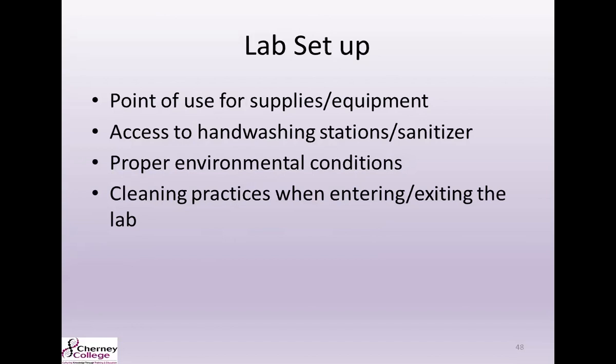You want to have your supplies and equipment at point of use. Like I said, you don't want to be running all over the lab. Make sure you have those supplies ready and in the best spot to be able to use them when you need them. Make sure that you have access to hand washing stations, lots of sanitizer. Make sure you have the proper environmental conditions, and make sure that you have accurate cleaning practices when entering and exiting the lab.